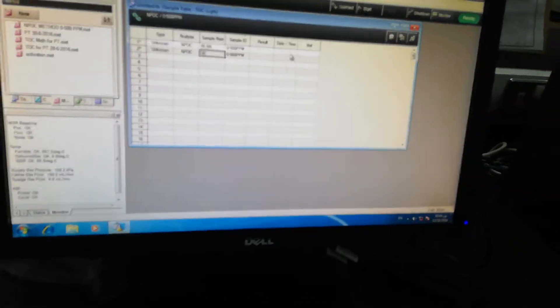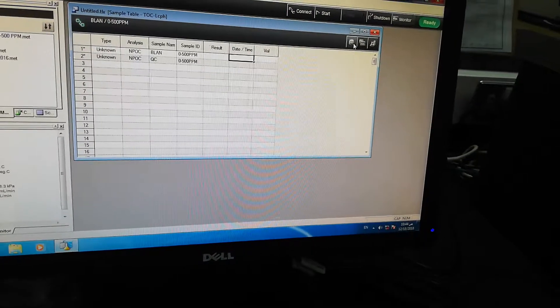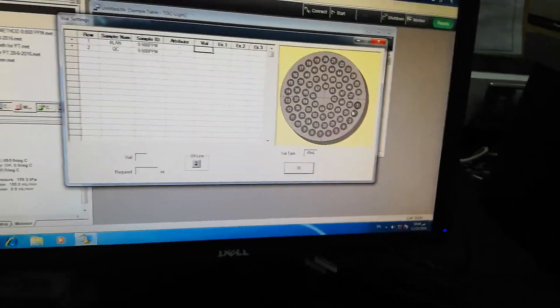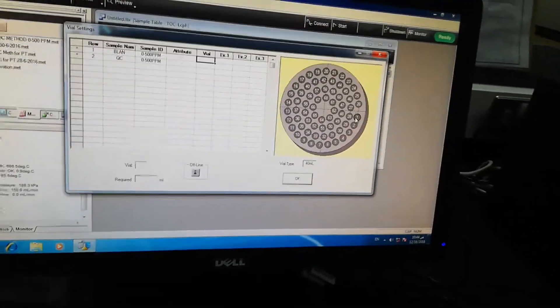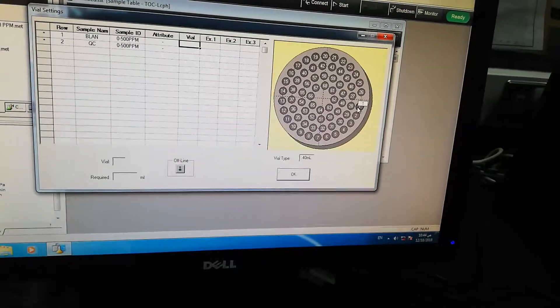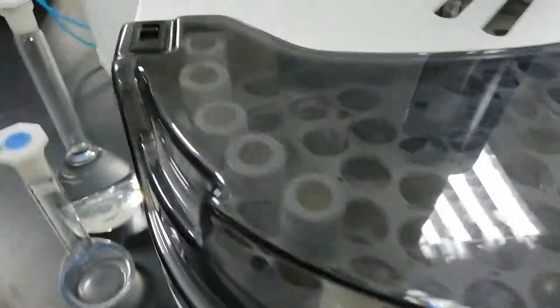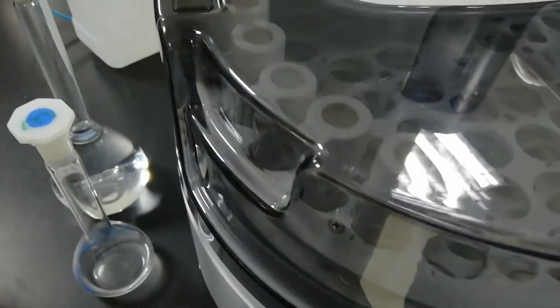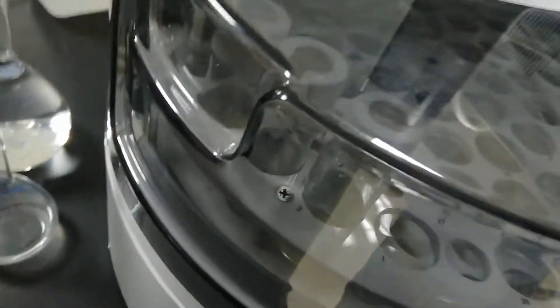So second, you have to add the vial. So here there are 3-4 options. From here, this is the option of the auto-sampler, so you can drag it here. Now where I have put some vials already in this, so I will just take one vial and see - see here on position 2 there is one vial.